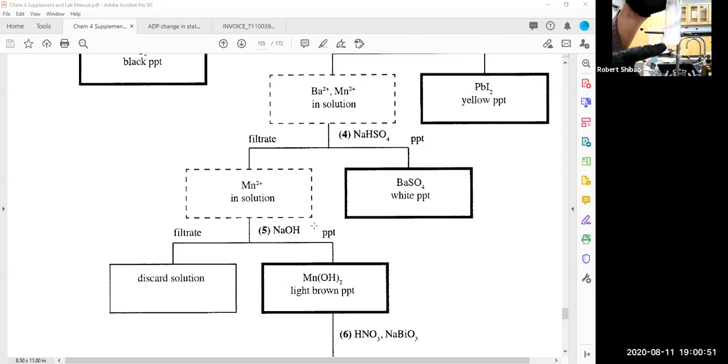One thing you notice is it looks like the filter paper didn't catch much of the precipitate. There's not that much precipitate in there. It looks like the precipitate is down here, and it seems as if there's a hole in the filter paper, but there is no hole. What happens is, in boiling water, we had a saturated solution of lead. I couldn't get any more lead to dissolve. And then as I filter, it cools back down.